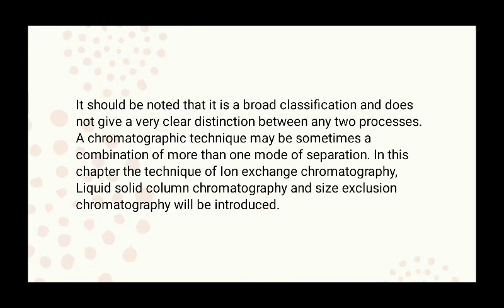It should be noted that this is a broad classification and does not give a very clear distinction between any two processes. A chromatographic technique may sometimes be a combination of more than one mode of separation. In this chapter, the techniques of ion exchange chromatography, liquid-solid column chromatography, and size exclusion chromatography will be introduced.